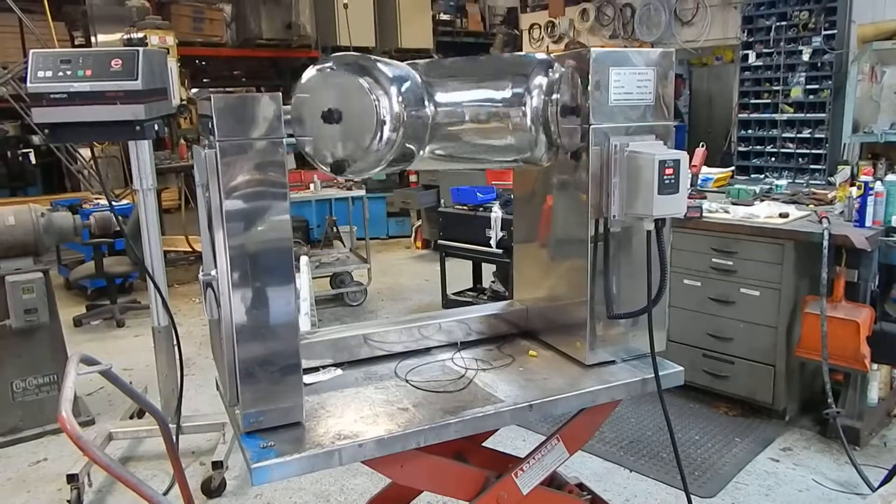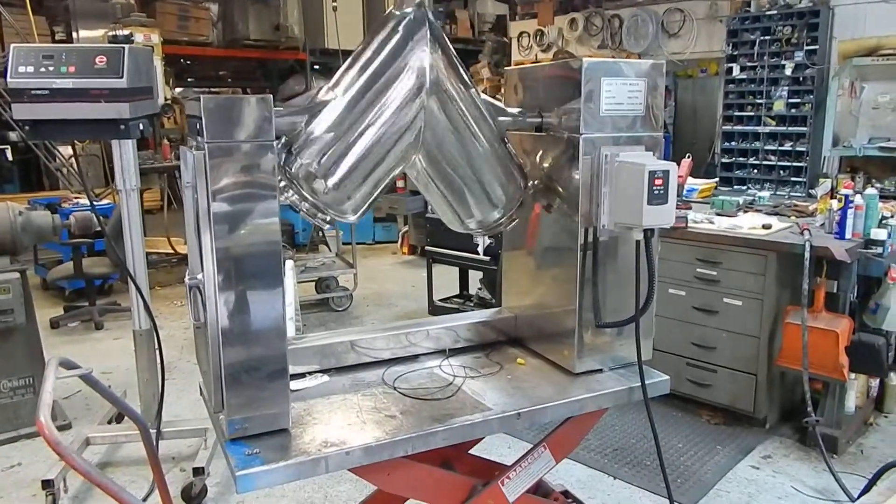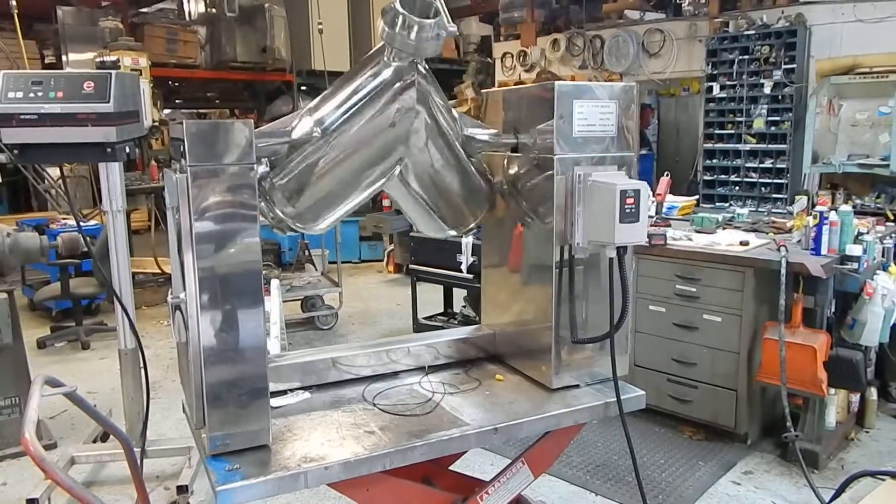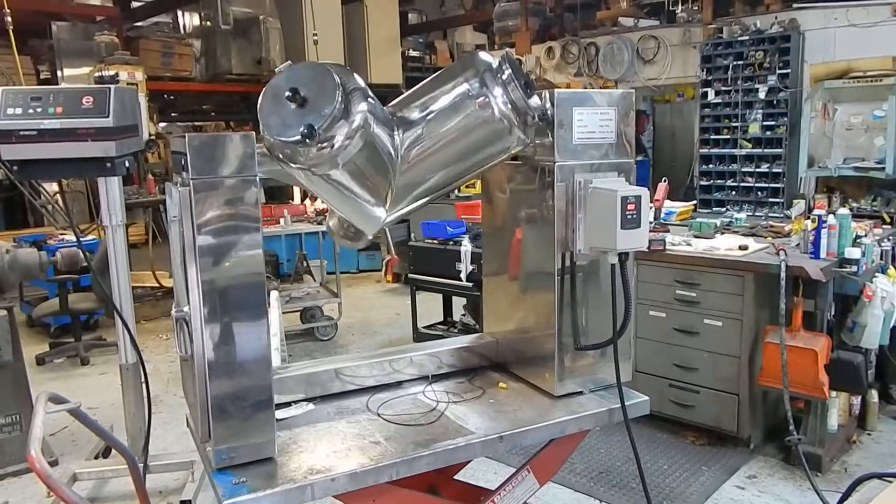Right now it's running at about 25 RPM, which is the standard speed — 20 to 25 RPM — for most of these units. That's what the original gear train was furnished as.